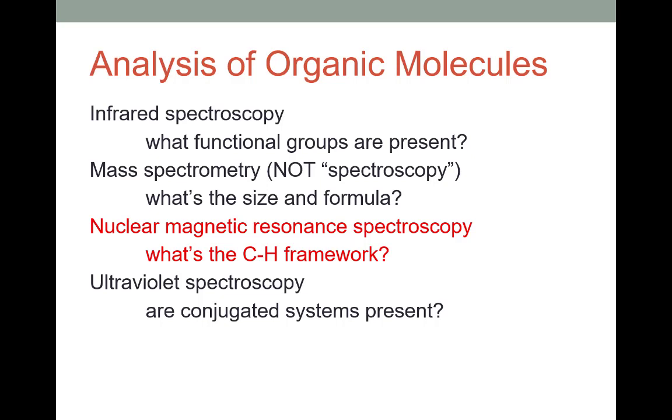Maybe we even have elemental analysis that would tell us, just like we talk about in general chemistry, the constitution of the molecule, its formula. NMR is really going to help us distinguish the structural framework for the molecule.